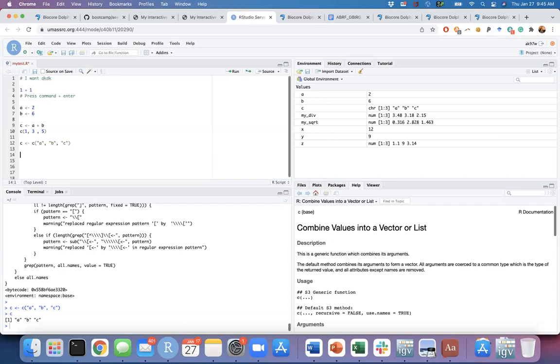For example, I'm going to create another one, D, with XYZ. We do these kinds of things a lot. For example, if you want to define the conditions for your samples, you write sample names into one and the conditions into the second one, and you prepare your data set to be able to run the DESeq algorithm. That's why I'm showing you these things.